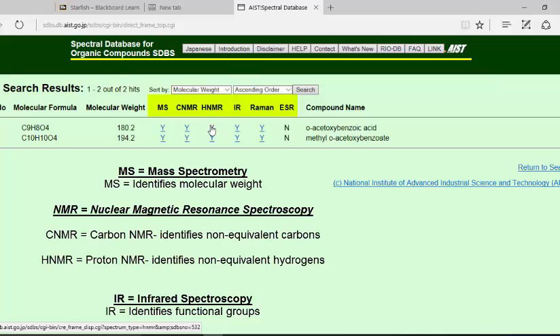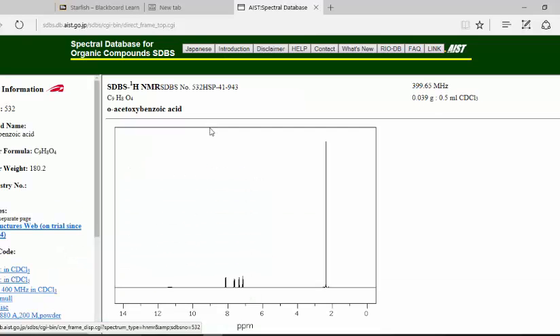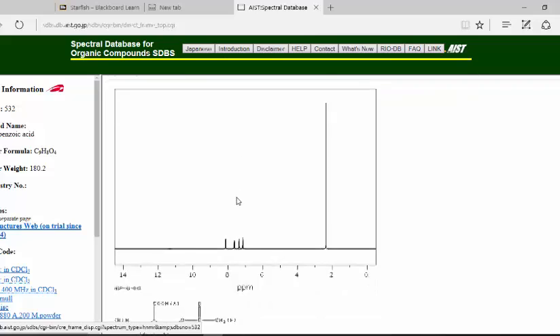So you click that, and it will give you a proton NMR spectrum.